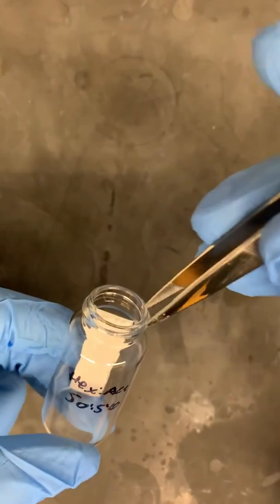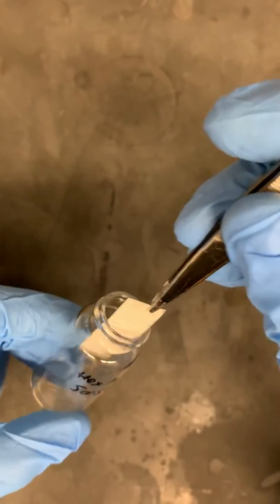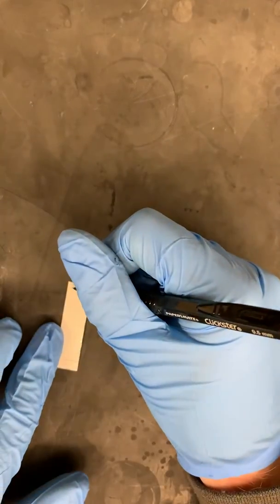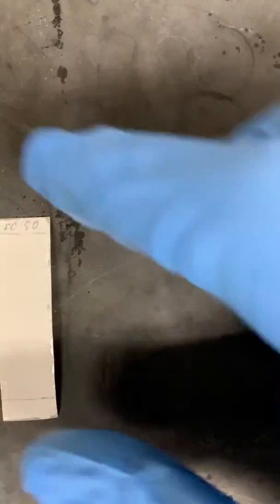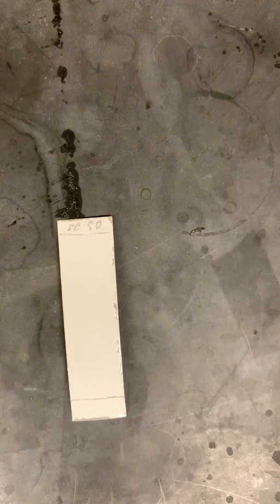Once the solvent level gets very close to the top of the TLC plate, we want to remove it from the solution and then very quickly mark how far the solvent traveled up the TLC plate with a pencil. Then annotate at the top the solvent ratio that was contained in the solvent chamber.